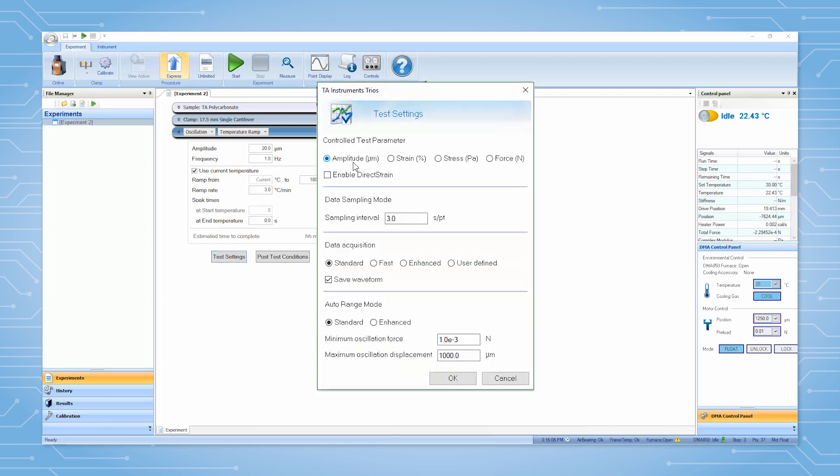We will use the default deformation mode amplitude. Direct strain allows the instrument to control the strain continuously. We will keep the default data sampling mode of three seconds per point. We will use the standard data acquisition.